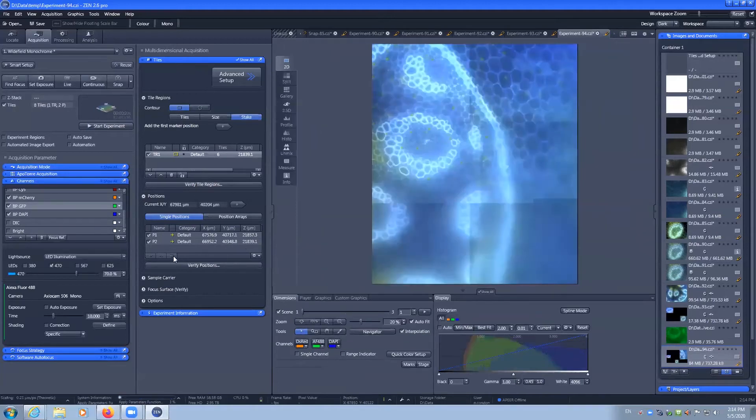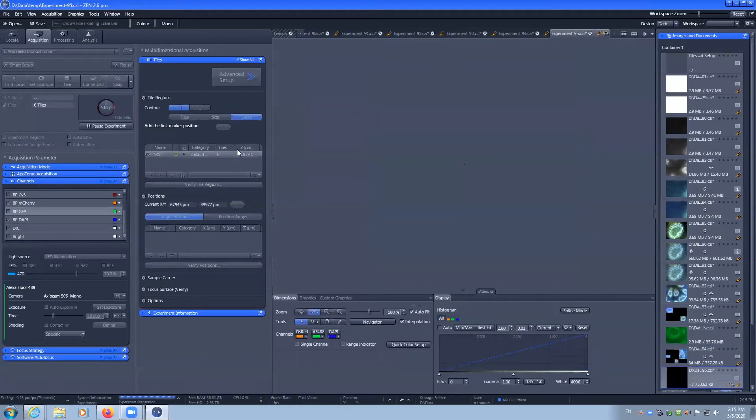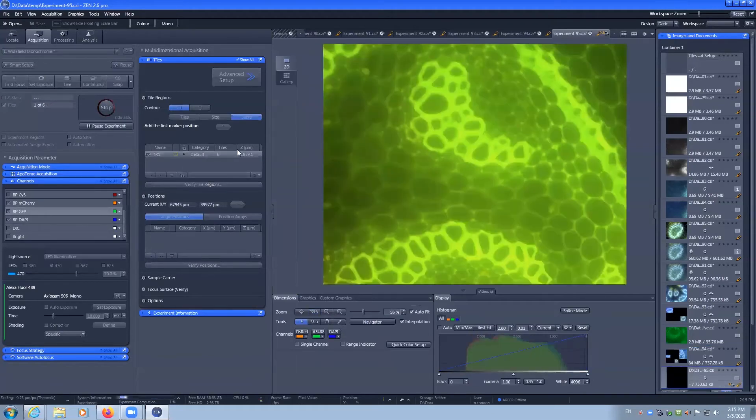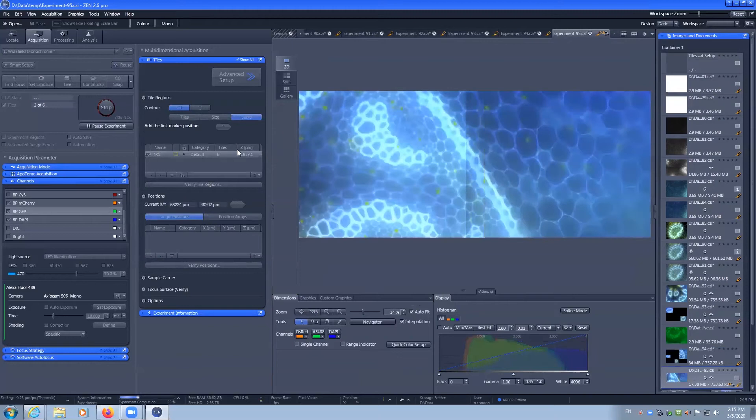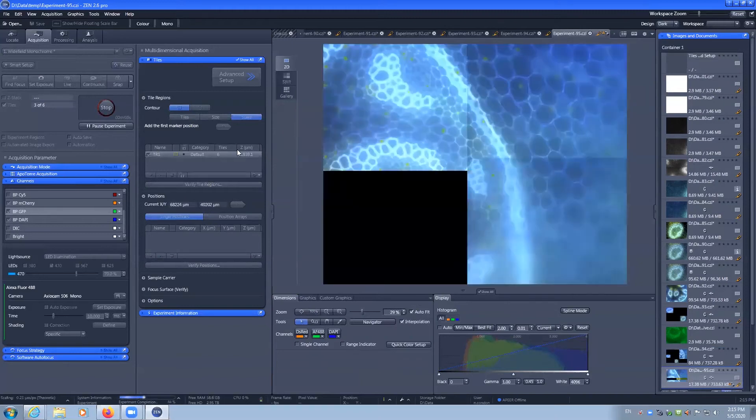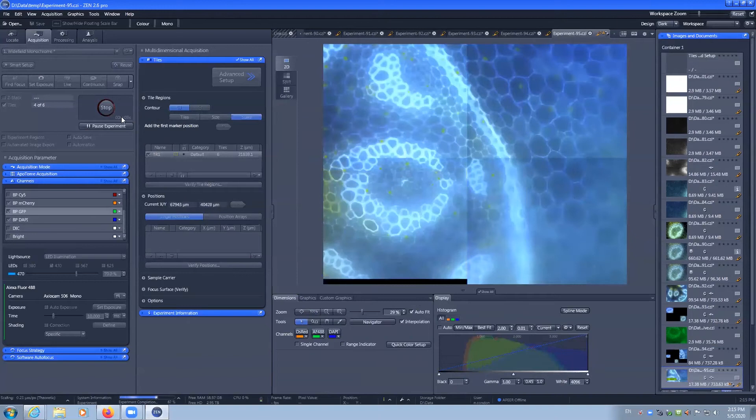So I can go ahead and delete these two positions and let's capture that again with just the six tiles that are of interest. And you can see that this takes quite a bit of time to capture.